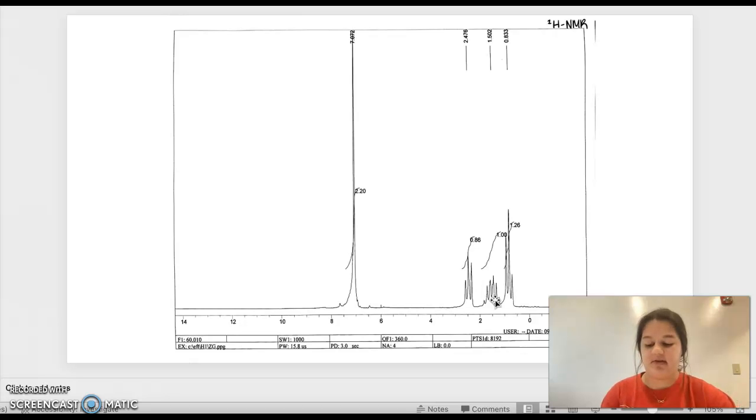The third signal we see is at about 1.5 ppm. It is a 1H multiplet, and I believe that the signal at 0.8 is also, the 1H triplet is also signaling for the same thing, just that there is a saturated CH bond far from the other functional groups.